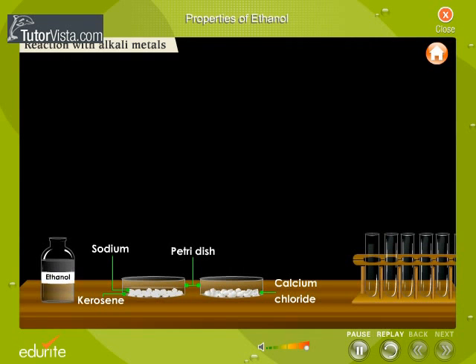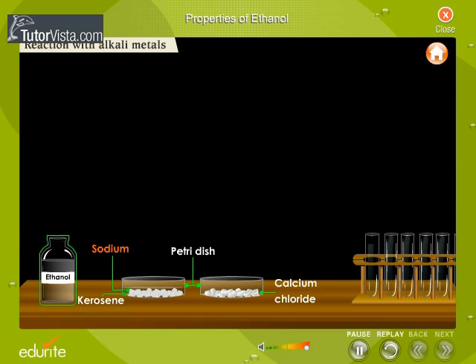Reaction with alkali metals. Sodium is an alkali metal. Ethyl alcohol, or ethanol, reacts vigorously with sodium. Let us perform this experiment and observe the changes.